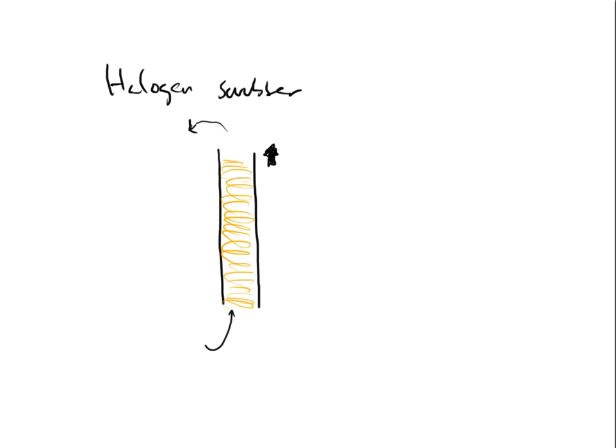You'll see it. It will look like copper, okay? And over time, what begins to happen is that my sample begins to react with the copper. Now, what in my sample? It's the halogens, my fluorine, chlorine, bromine, and so forth. Those are the pieces that begin to react with this copper. Over time, when that process begins to happen, this copper will slowly start to tarnish, and I will start to see this copper start to go blackish or grayish. It won't be coppery looking anymore, okay?